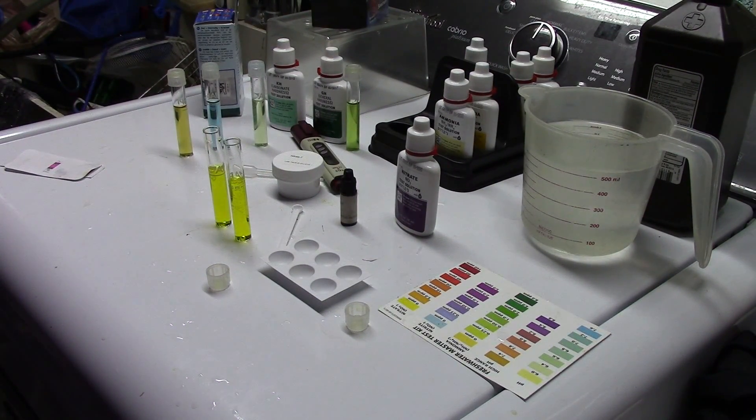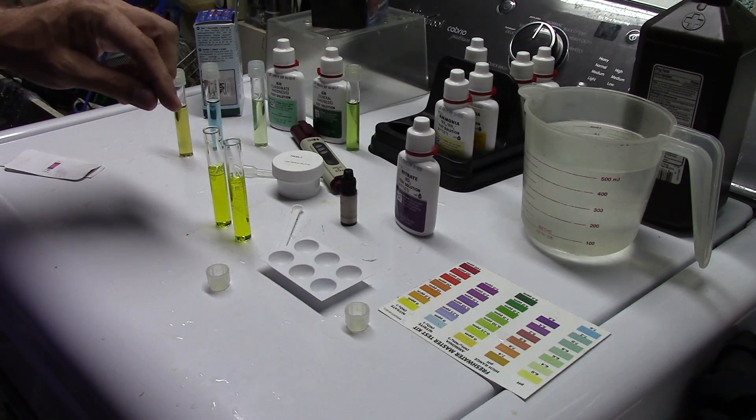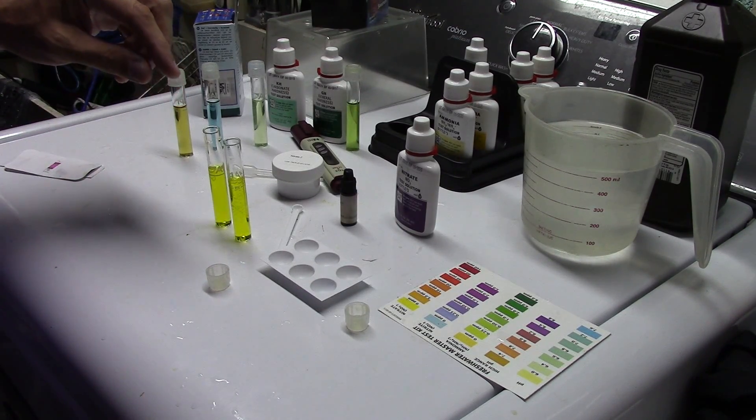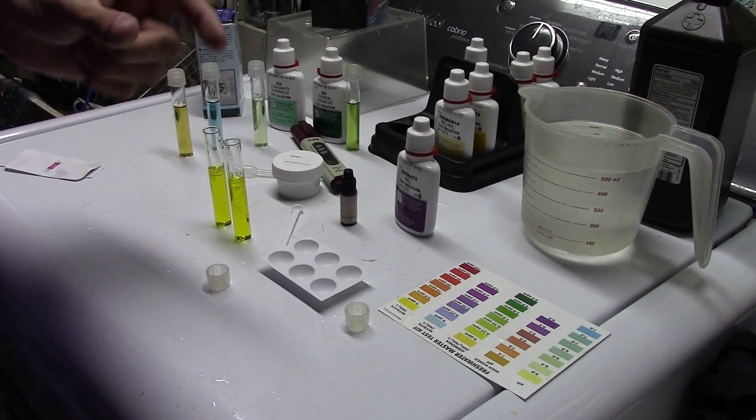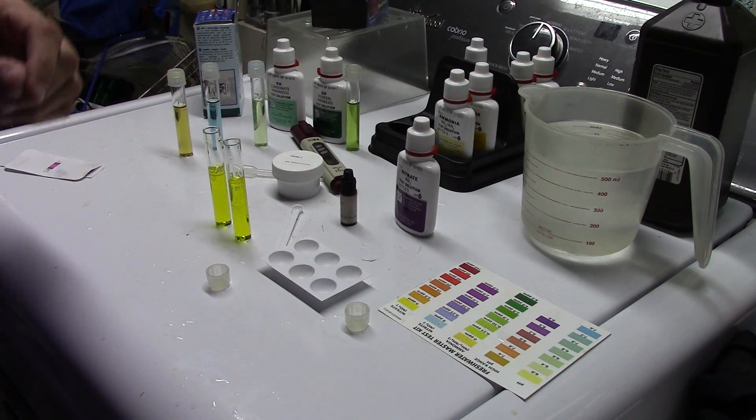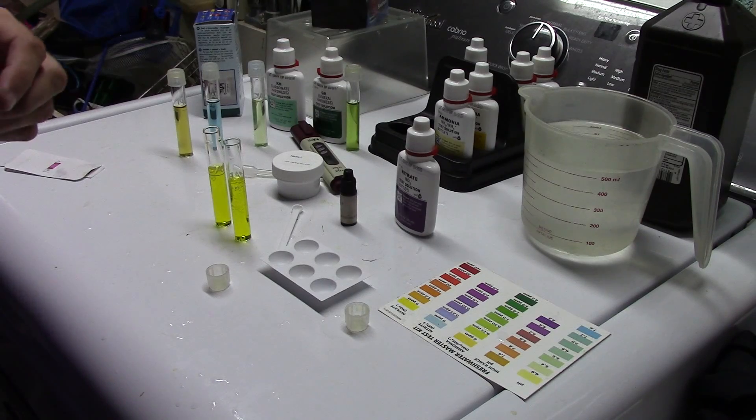Today we're doing a follow-up video to one I did the other day where I showed you a comparison between the API test kit and the CCHEM test kit. In that API test, the way I did it, I did not thoroughly shake the sample after adding the second reagent — I simply inverted it several times for nearly a minute. A couple of my viewers pointed out, and I double checked, they are correct: the instructions say to shake that vial vigorously.